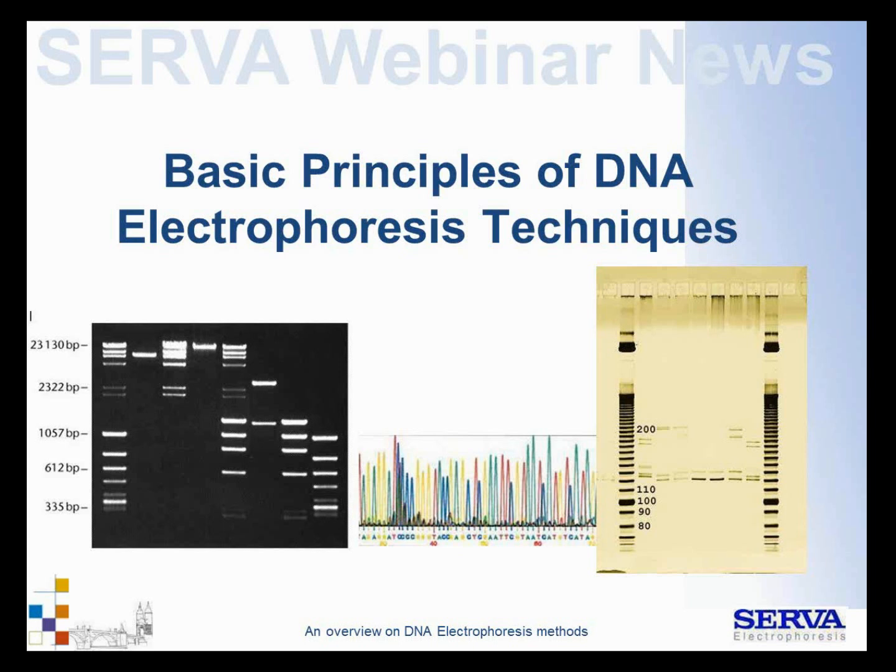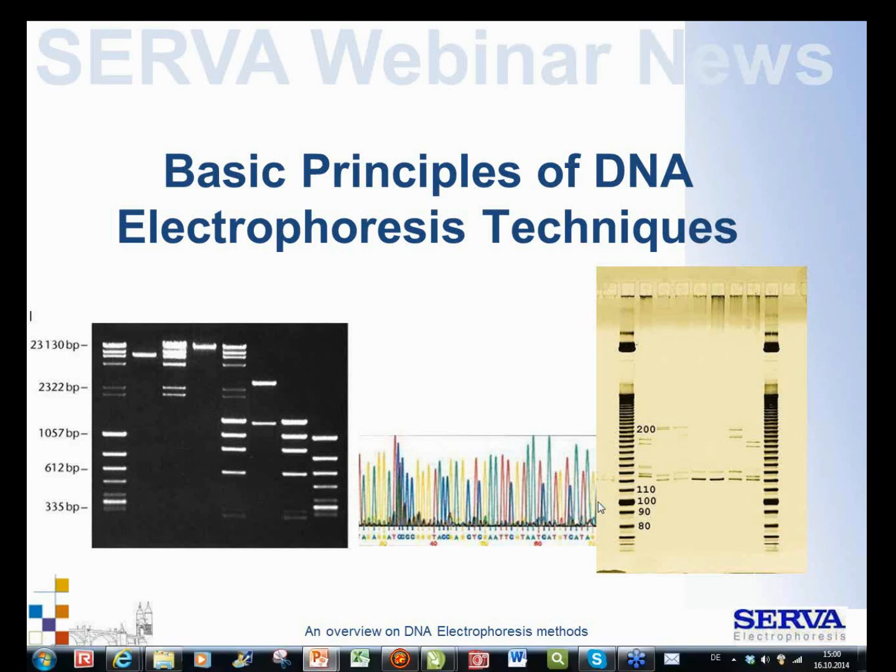We are talking about the principle of DNA electrophoresis techniques, the specialties for DNA nucleic acid separations, and these applications have changed quite a bit in the last 2 decades. I will talk a little bit about what happened and what has changed, and where we stand today with the DNA electrophoresis techniques.